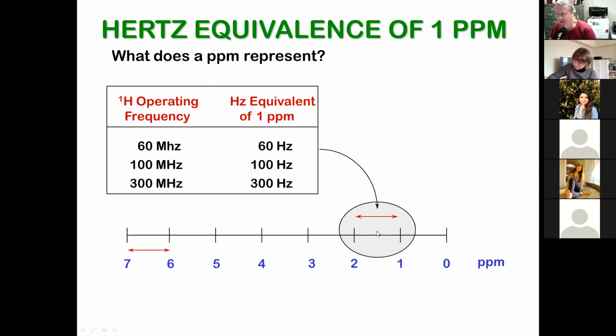On a modern machine, it's more hertz, and that gives you more resolution. If I buy a modern NMR for $500,000, I get better resolution, because there's a lot more space in 1 ppm. You can actually get better signal. That's the basic takeaway message. And ppm is cool because we have a single scale that is universal worldwide. Everybody uses the ppm scale.